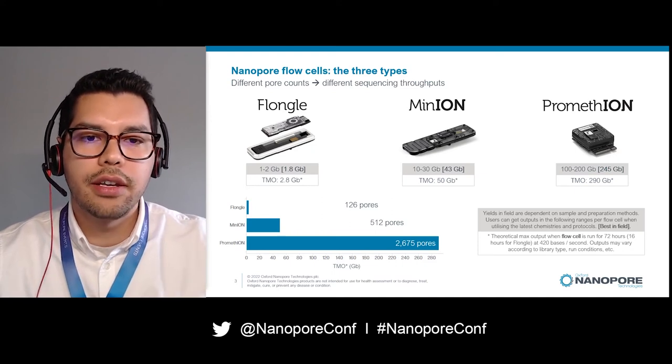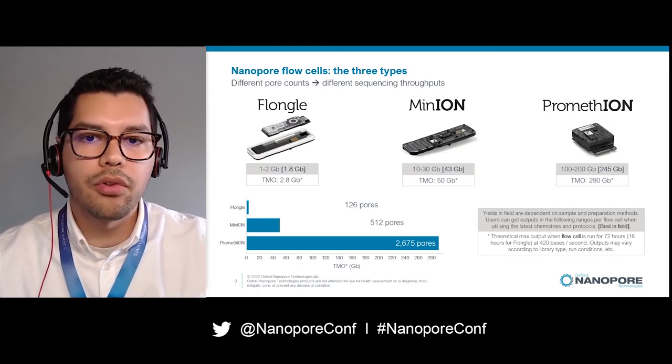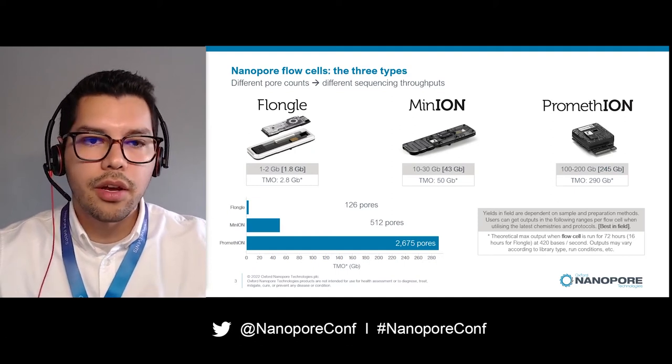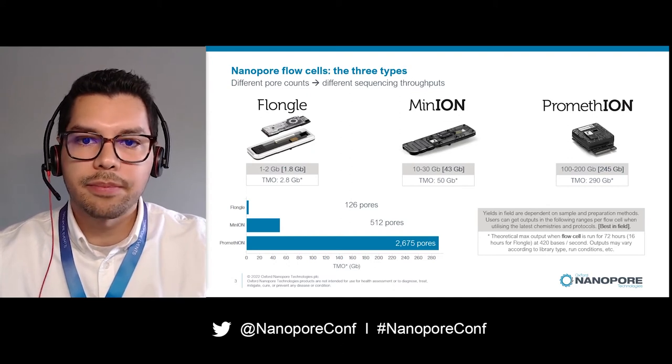To give you an understanding of exactly how our users are pushing the boundaries of these flow cell types in the field for their experiments. And then underneath that, under TMOs, the theoretical max output for each of these flow cells.